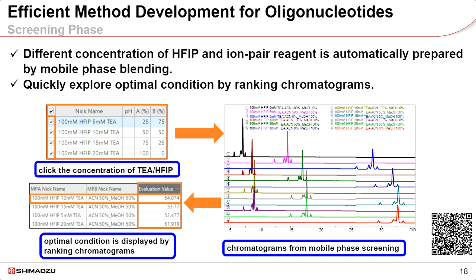So our ability to minimize our separation time while achieving the desired level of separation and minimizing these components is key. And the optimal value for those small amount additives may be somewhere in between the classic 5, 10, or 20 millimolar preparations that you might do if you had to prepare them by hand.